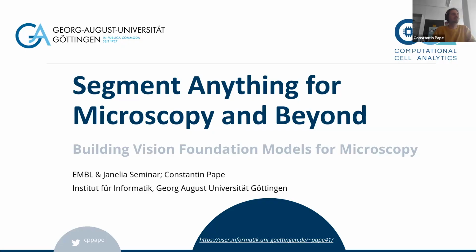Thanks a lot. Thanks for the kind introduction, Tishy. Yeah, and so I'll talk a bit about our research related to Segment Anything and how we adapted it for microscopy today, and also talk a bit more broadly about this effort to build vision foundation models for microscopy.